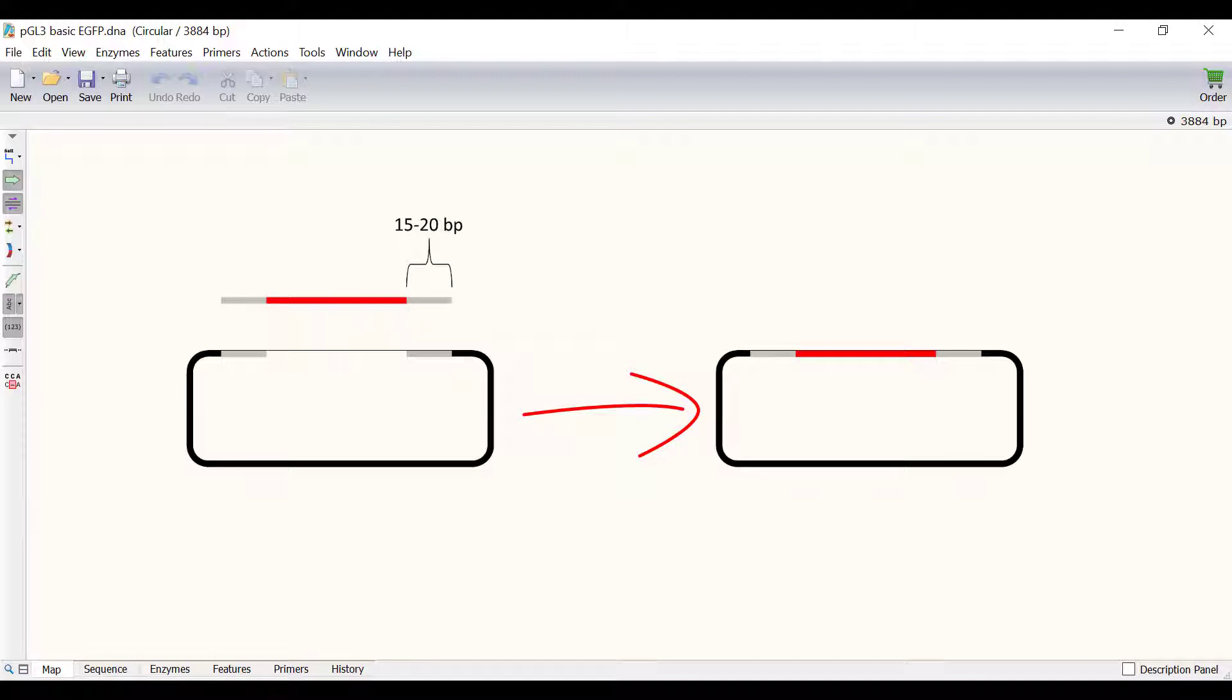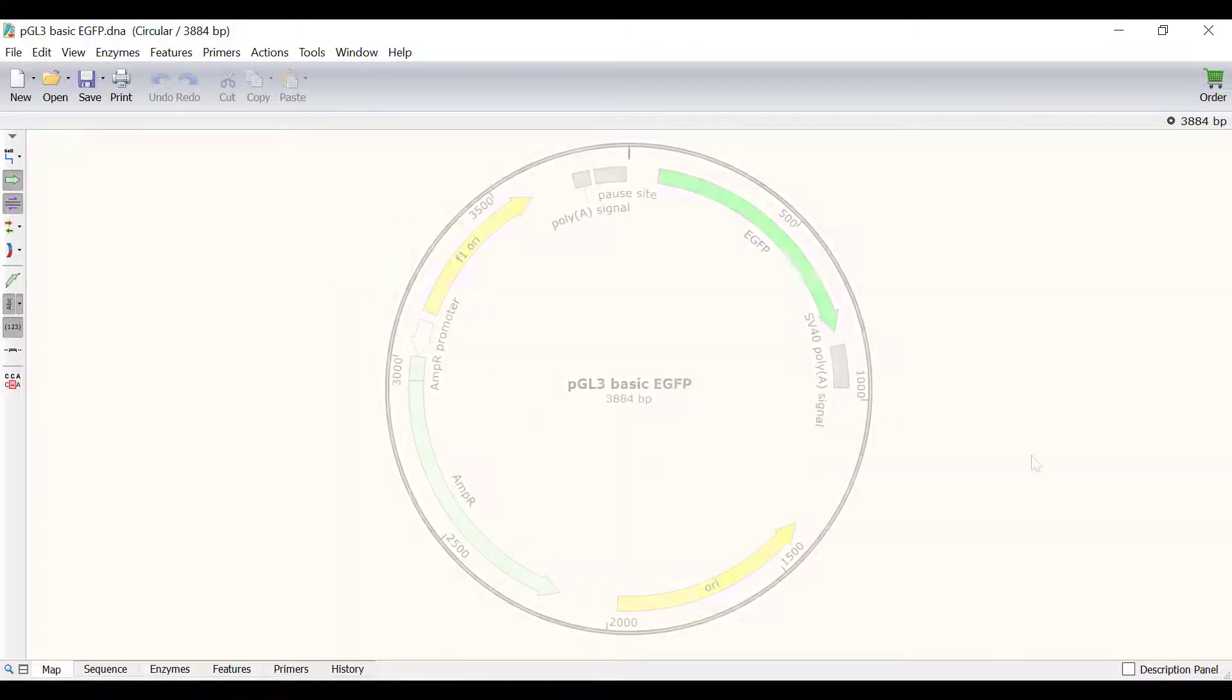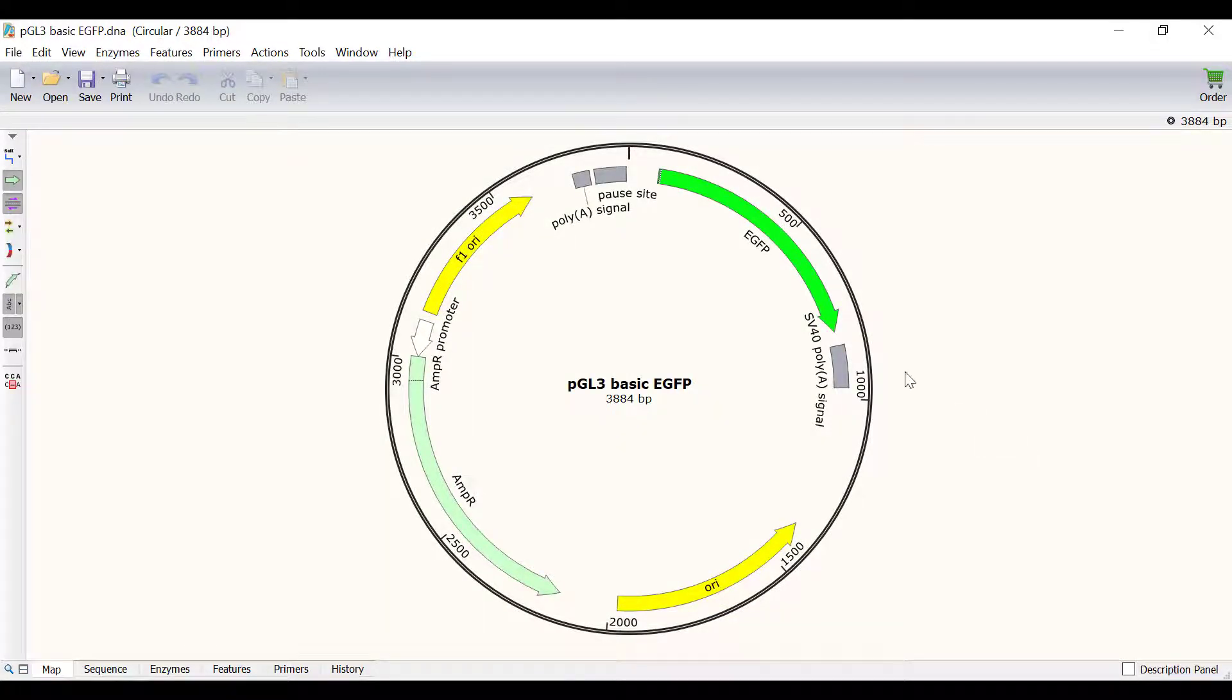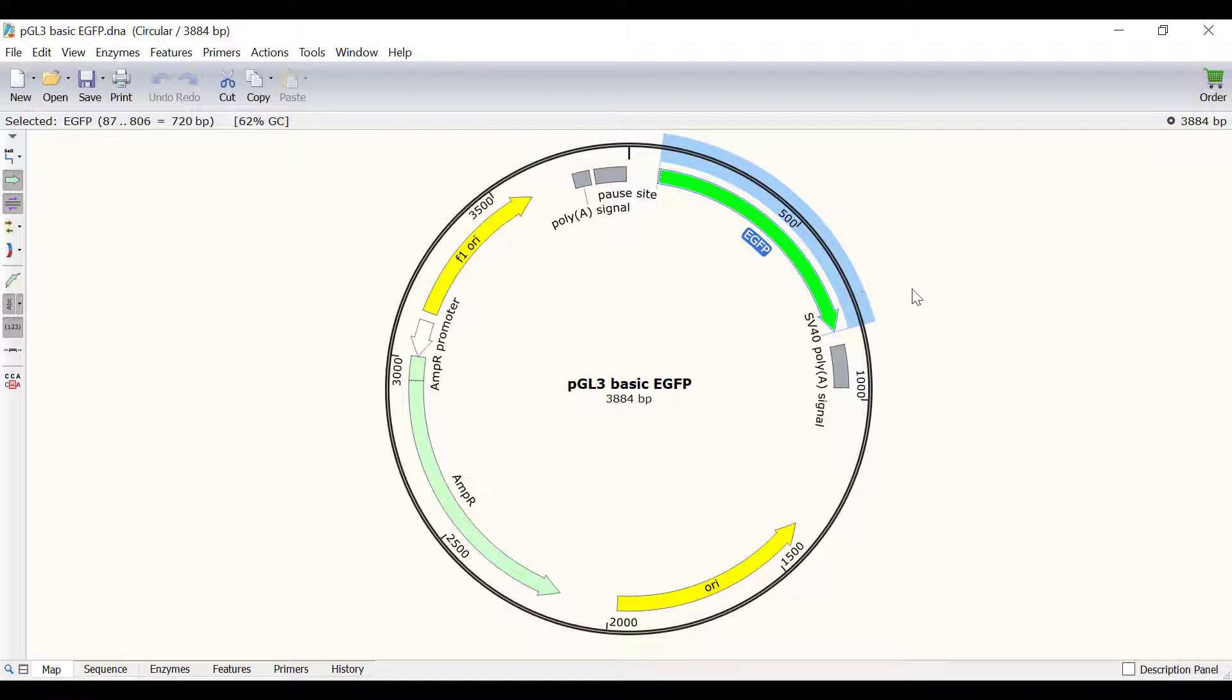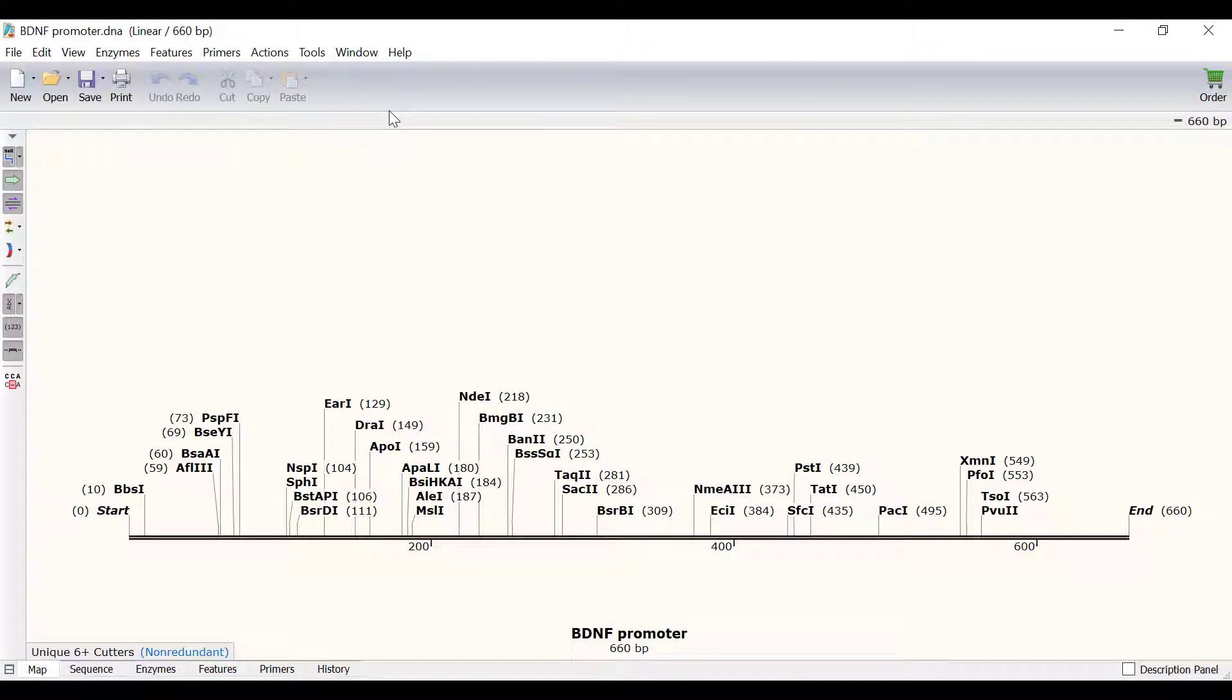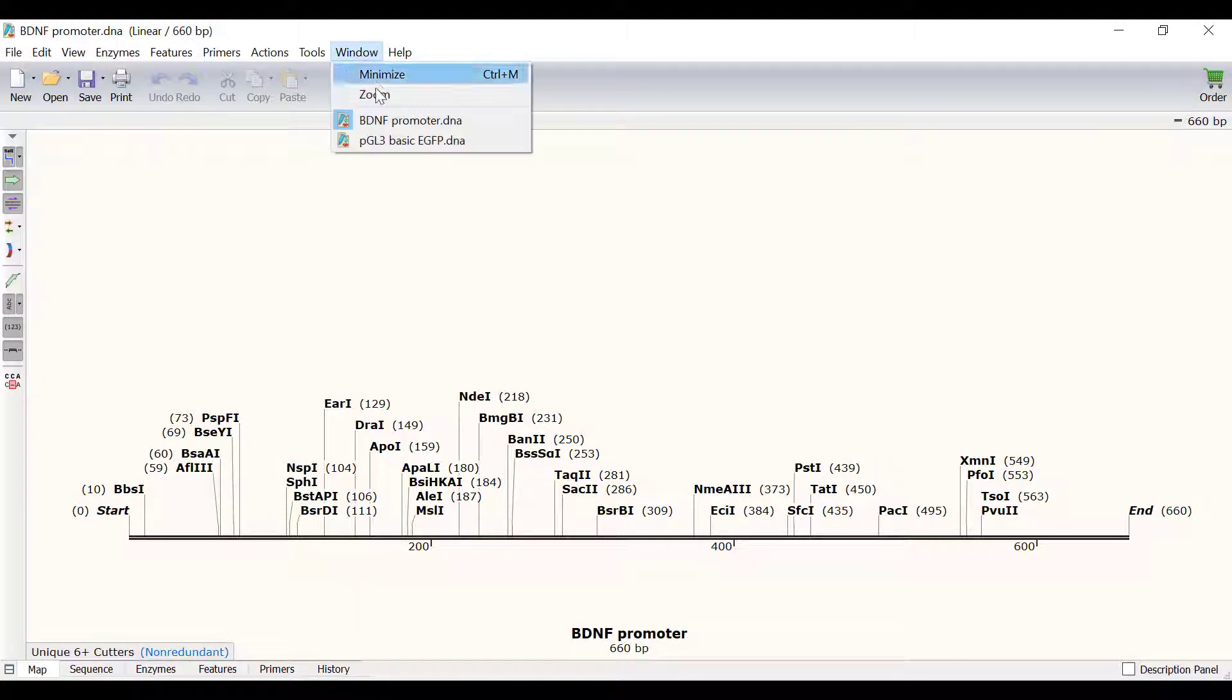In Snapgene these steps are all simulated in a single tool. Let's see what this looks like. I have a PGL3 plasmid open that contains a GFP reporter. In another file I have the sequence of the BDNF gene promoter. What I want to do is to insert this BDNF gene promoter into the PGL3 plasmid.